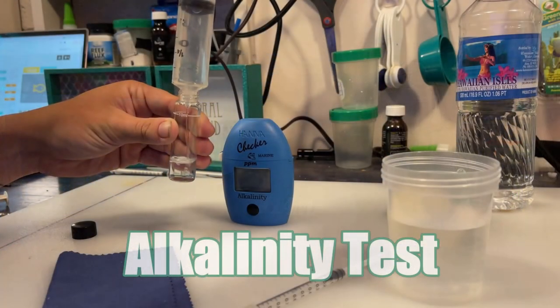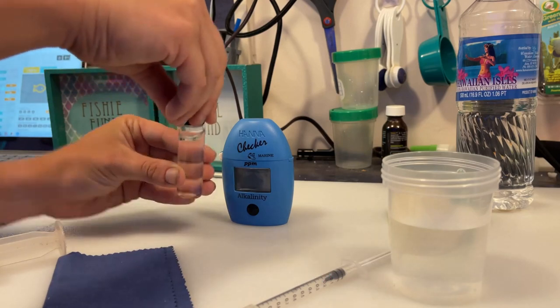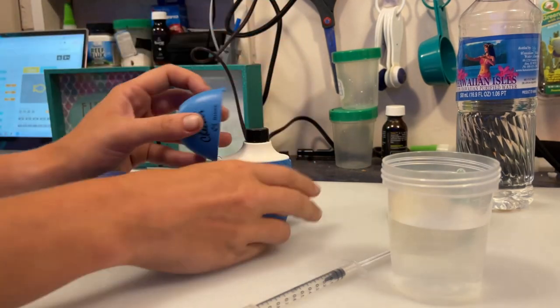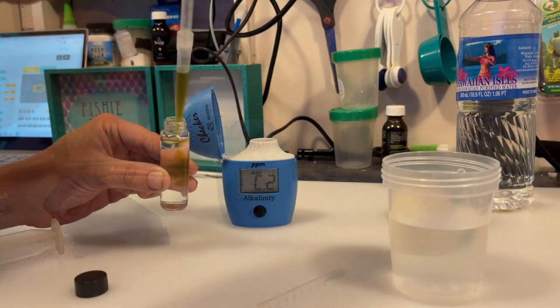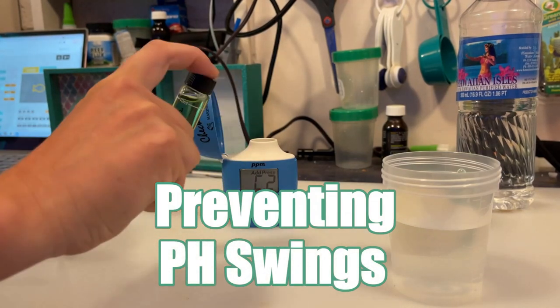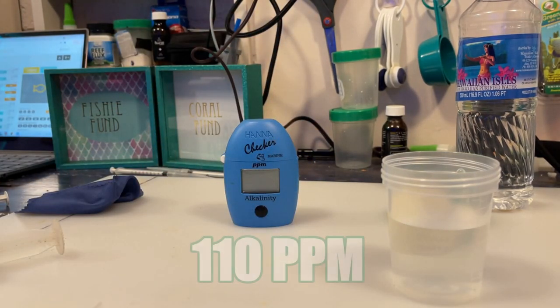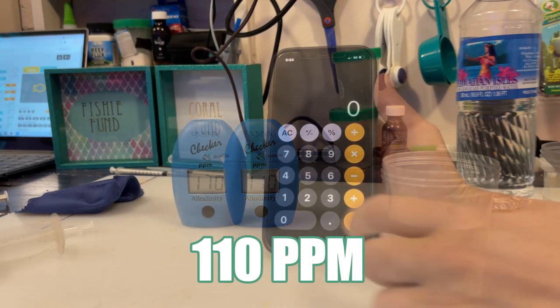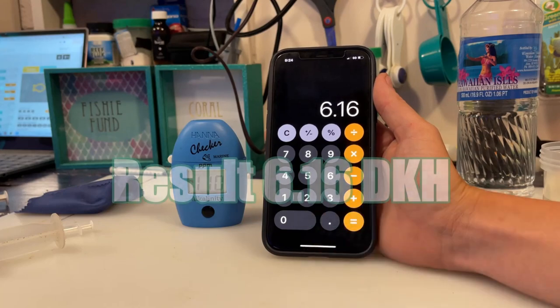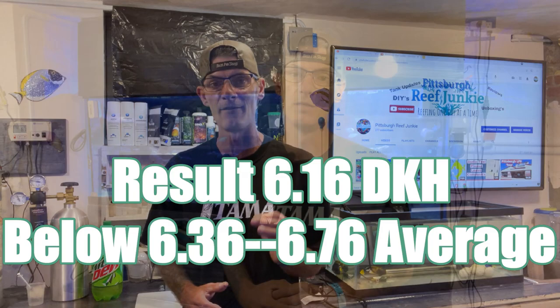Carbonate hardness, otherwise known as KH to hobbyists, naturally decreases through changing water levels. We will be using the Hanna KH Checker to test our sample. KH also plays a role in pH values by preventing pH levels from rising or falling rapidly. For our result, we have 110 ppm. Once we do the math on our calculator of 110 times 0.056, we have a KH of 6.16, which does fall below the 6.36 to 6.76 average.